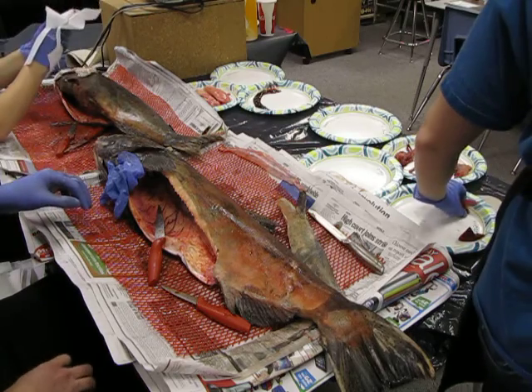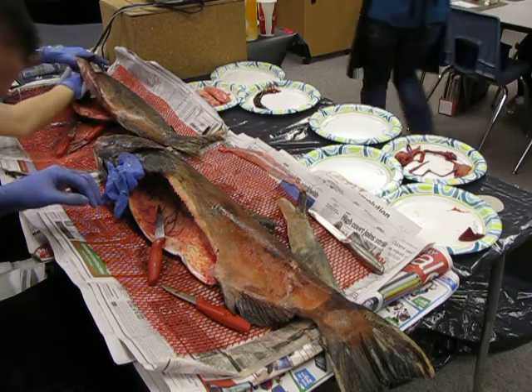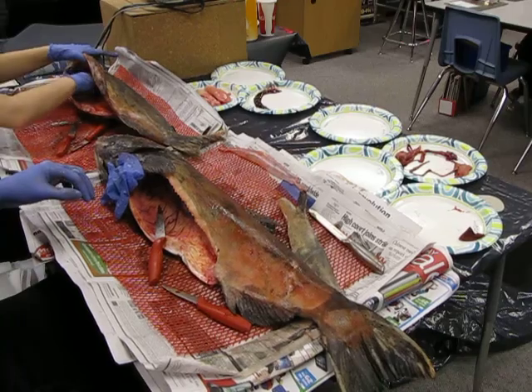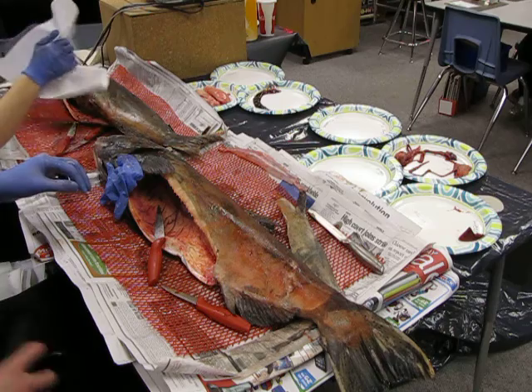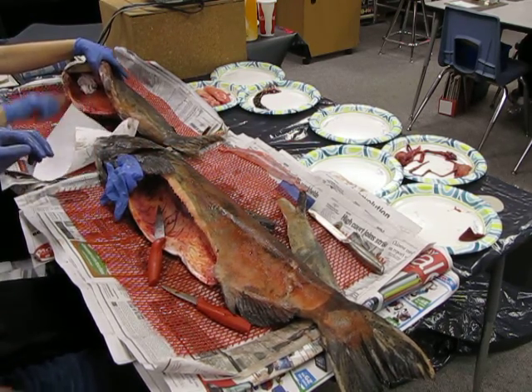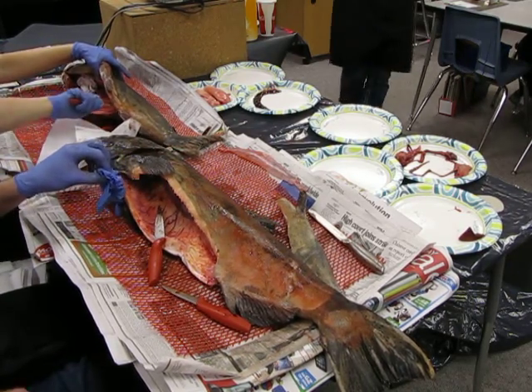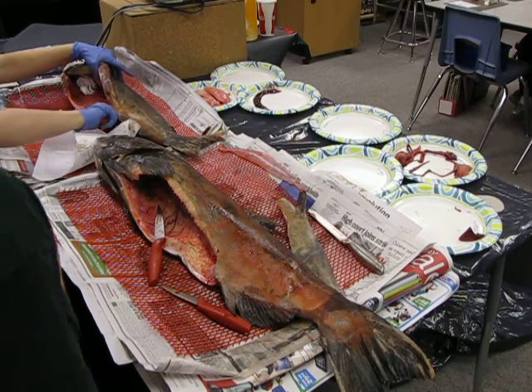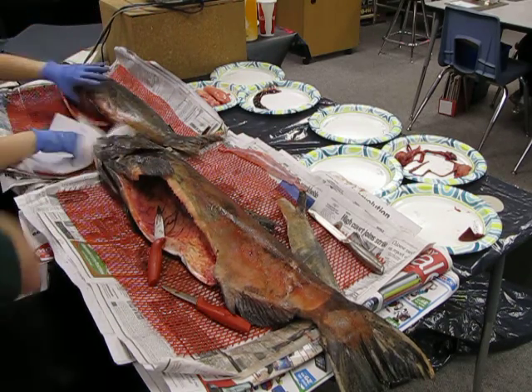All right. Take a look at a salmon heart. Come around and show you guys. The heart is a really strong muscle that pumps blood through our bodies, and your human body. When you do get a chance to feel it, it's really tough because it's such a strong muscle. The top of this heart here is called the aorta. It's where the clean blood goes out.